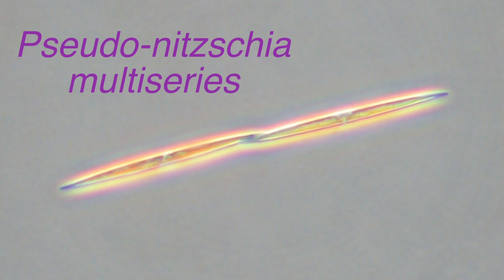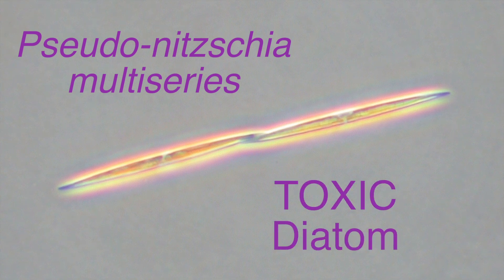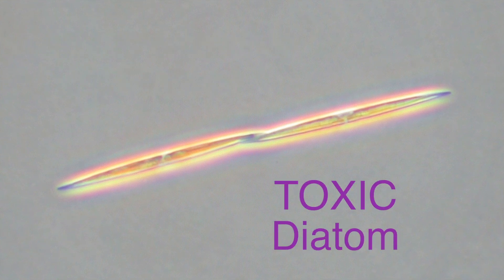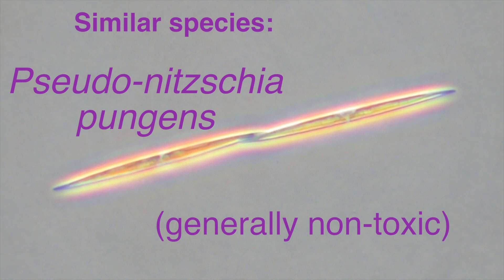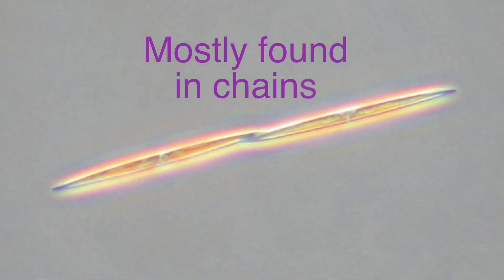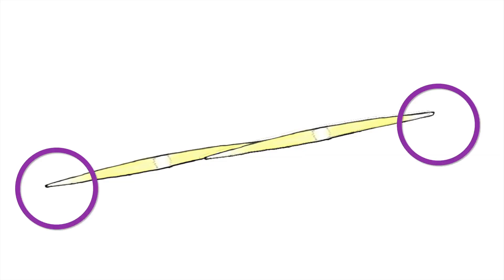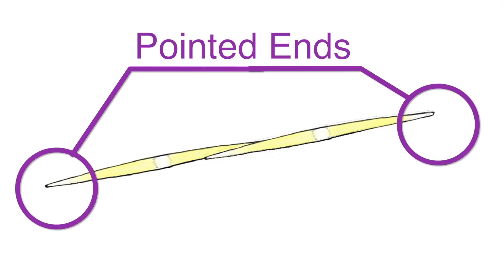Pseudo-nitzschia multiseries, also a large-type Pseudo-nitzschia species, is toxic and indistinguishable under the light microscope from Pseudo-nitzschia pungens, which is generally non-toxic. This group is also normally found in chains, and the cell ends appear more pointed than the previous group.